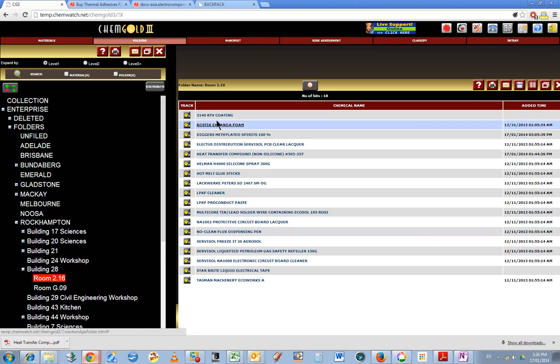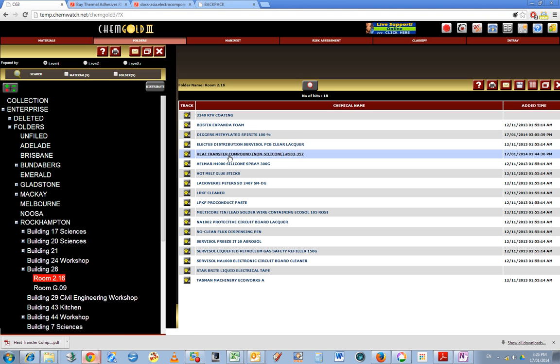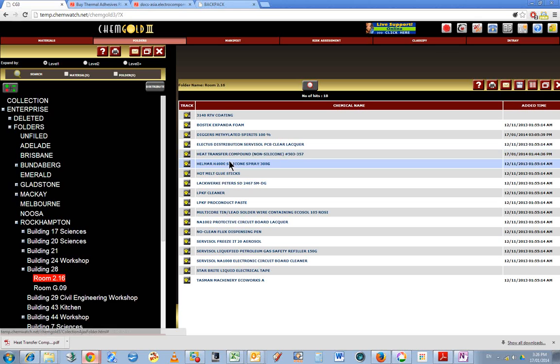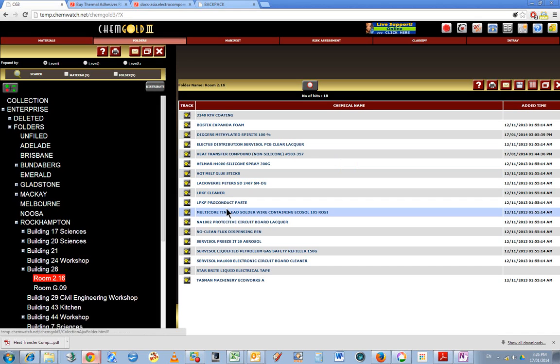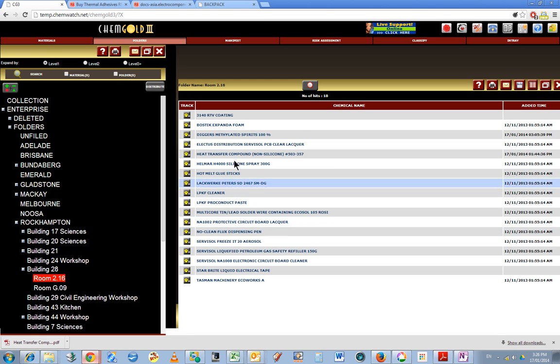For example, the 314R TV coating, Diggers methylated spirits, heat transfer compound, and star bright liquid electrical tape. There are four of them that I've added there.